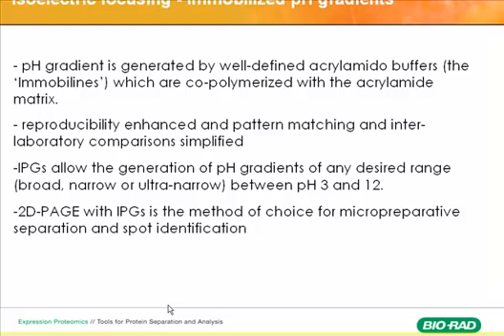Before this was invented, it was extremely hard to pick up a worm-like gel and try to put it on the second dimension SDS-PAGE gel, but with the support of the plastic film that problem was solved.